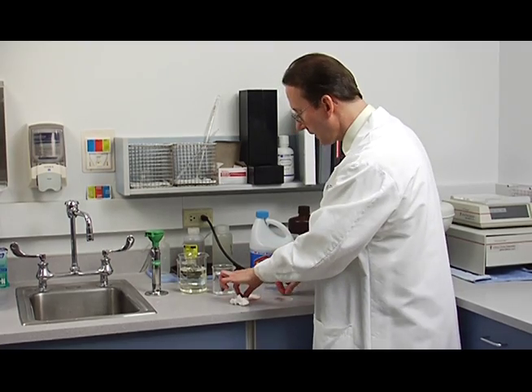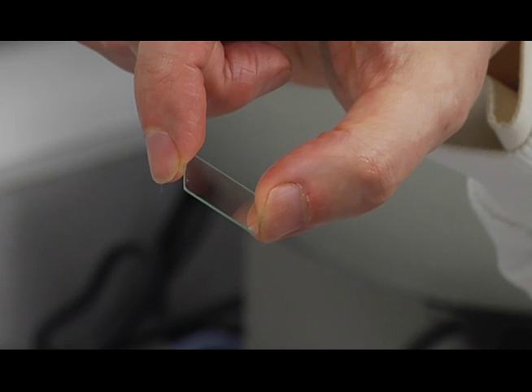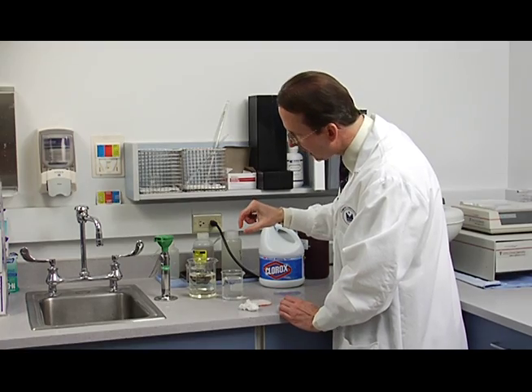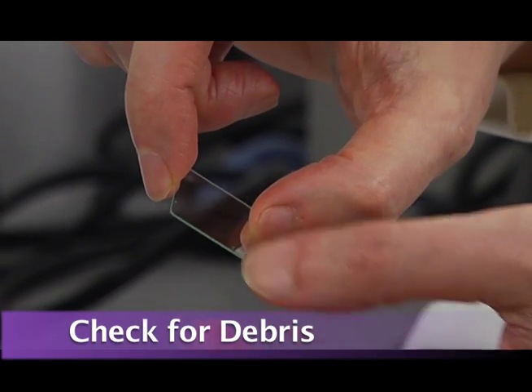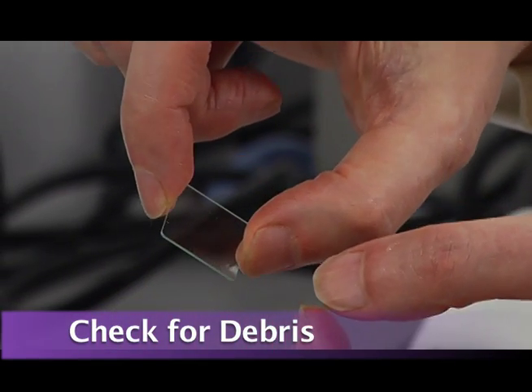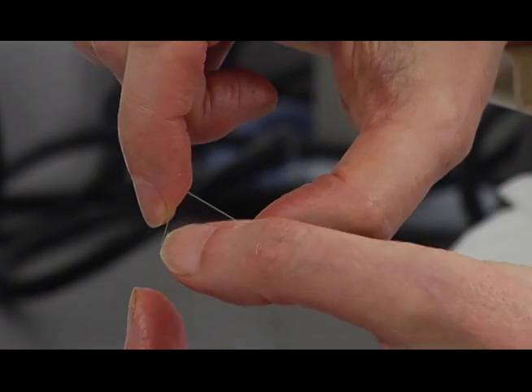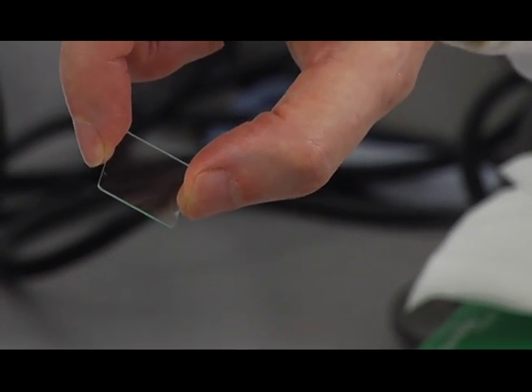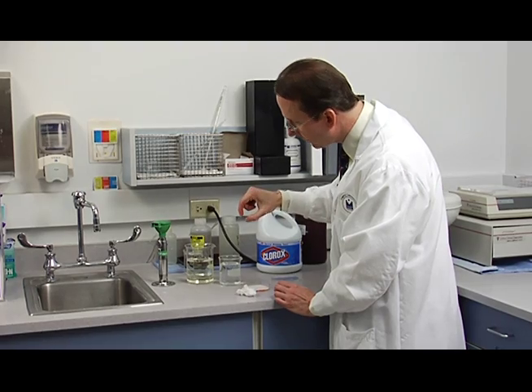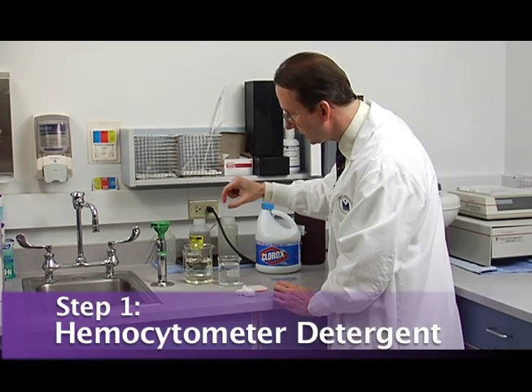Then we will wash the cover slip the same way. So you want to look at your hemocytometer cover slip and check for any debris or film on it. Generally, the places that will have the most debris on it will be these corners here and these edges. That's where material is most likely to dry on the cover slip. So even if I don't see any material on it, I will still go through the washing procedure.